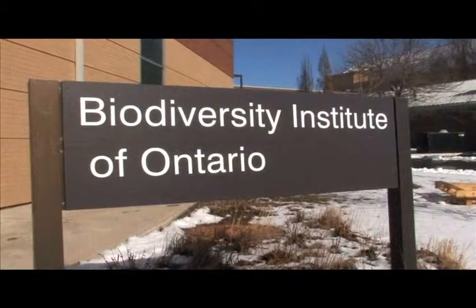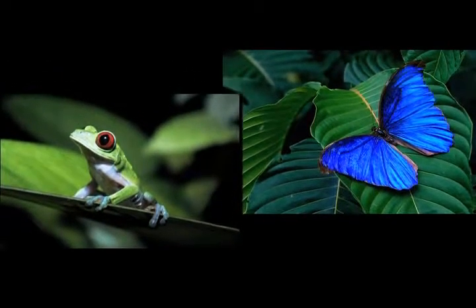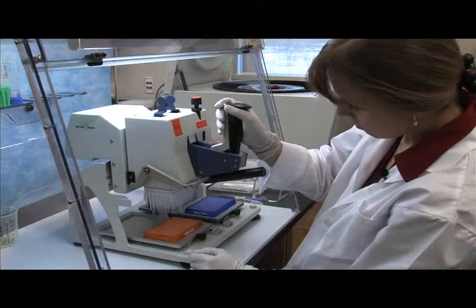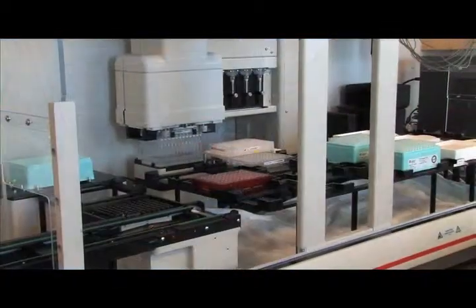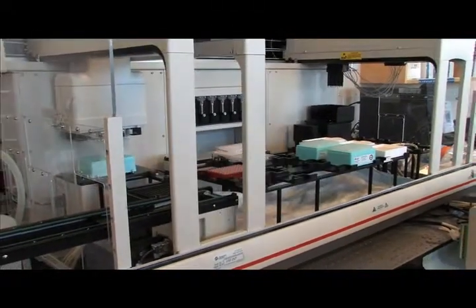At CCDB, the starting samples for DNA extraction come from different sources, such as insect legs, ethanol fixed tissue, dried plant or fungal tissue. Typically, the CCDB processes 20 to 40 plates per day. Here is a demonstration of DNA extraction from animal samples on the robotic platform.